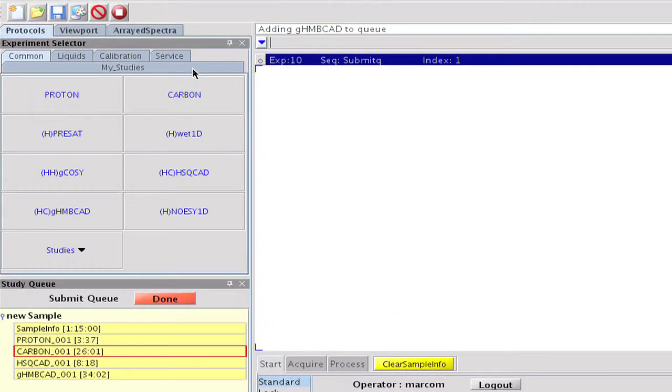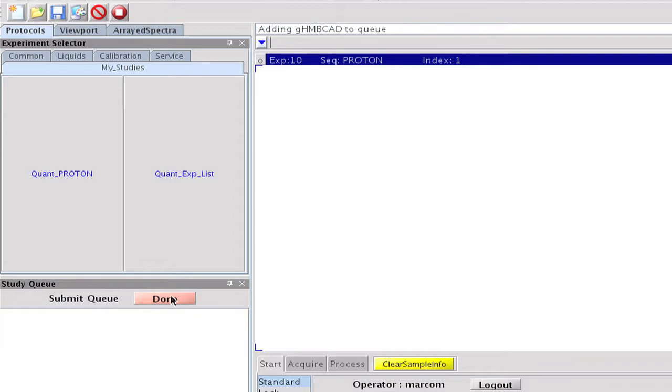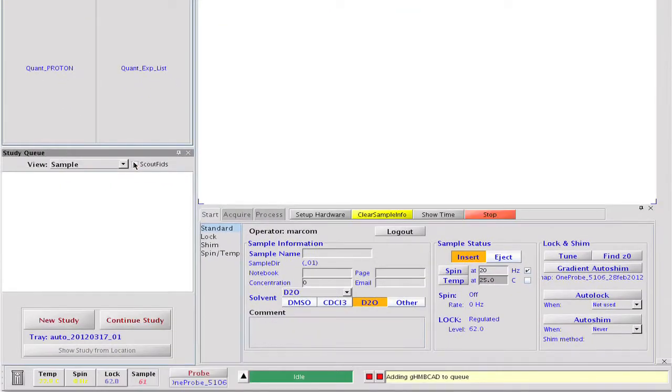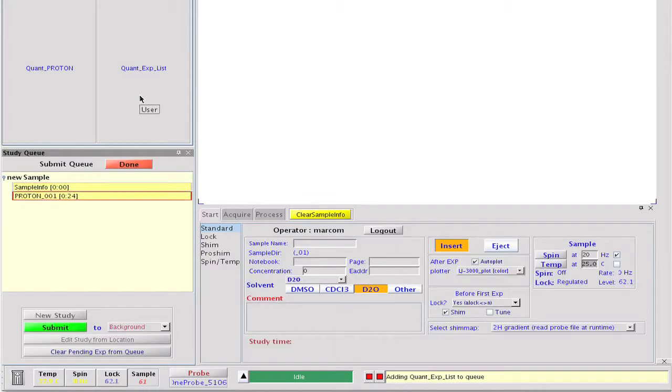Once again, the interface is updated and our new Experiment button is ready to use. We start a new study and request our freshly made study collection. All experiments with the saved customization appear simultaneously.